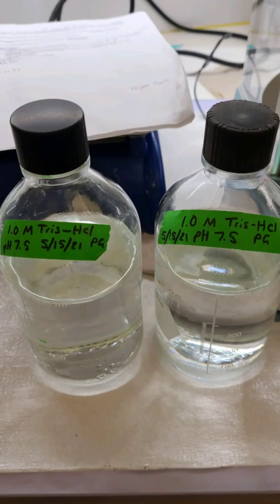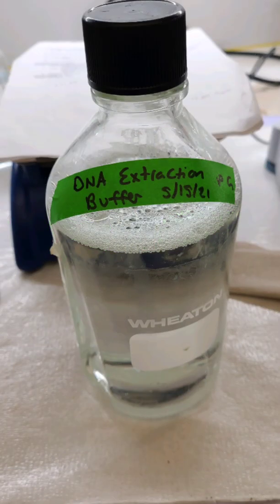With this I have now restocked my stock solution of Tris-HCl and I'm able to finish making the DNA extraction buffer. It is 7:30 p.m. and I am finally leaving the lab. It's been a good evening — got a lot of stuff done. I've done some more gels and it was a good break from the stats.